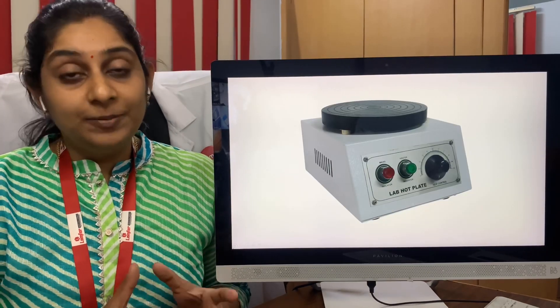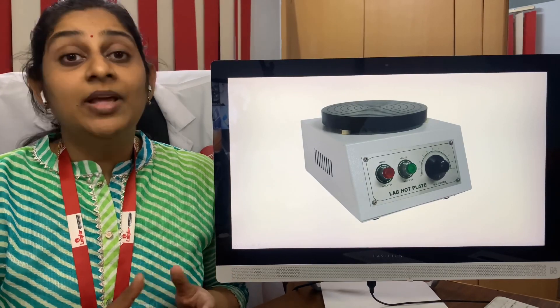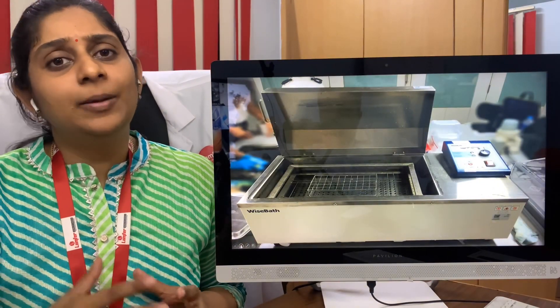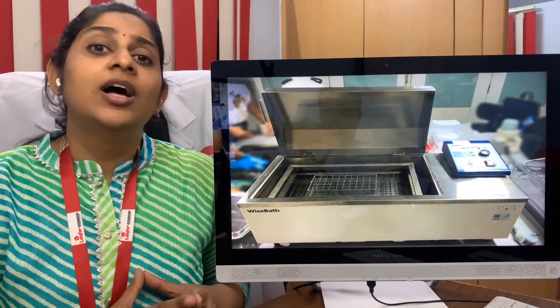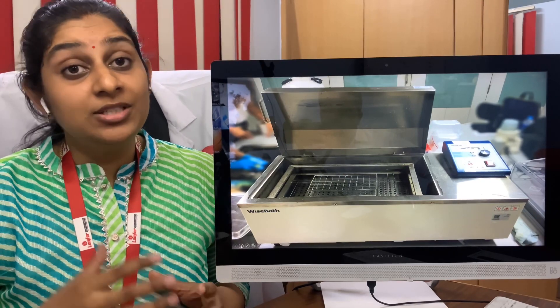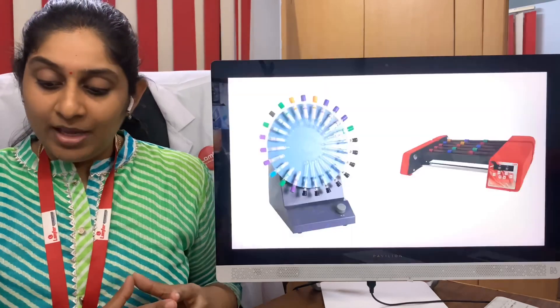The next one is the hot plate, which is needed in clinical pathology and microbiology. After that comes the water bath, which is mainly needed for pathology. If you're going to have FNAC or histopathology, this water bath is going to play a major role in your laboratory.